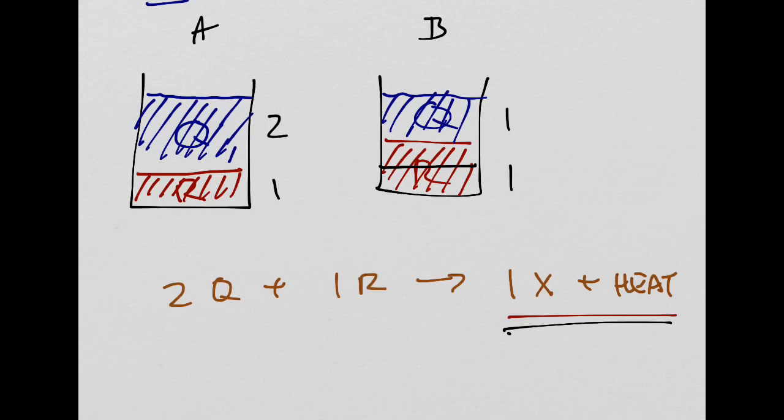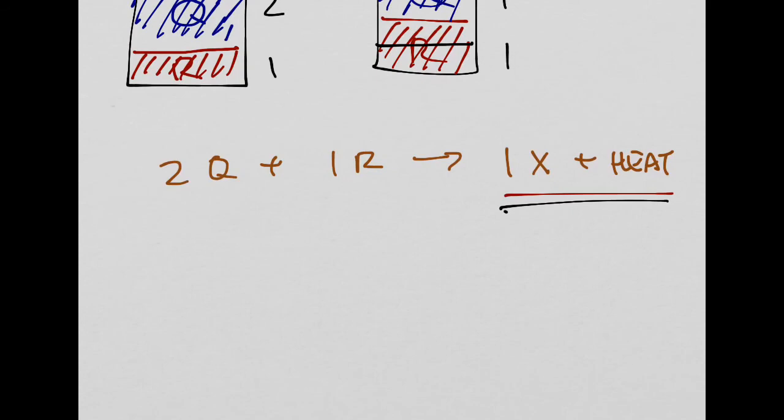All right, I hope that helps you. The only other thing I want to impress upon you is that we used phenolphthalein, and phenolphthalein is an indicator for base. If there's any excess base hanging out, then the solution is going to be magenta. If all the base has been used up, however, then it's going to go to the colorless clear solution that you had initially. Okay, bye.